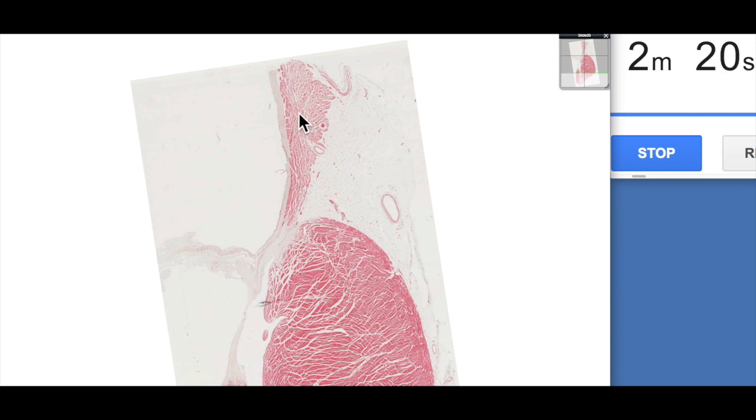Then we have the myocardium which of course is predominantly made up of cardiomyocytes and then we have the endocardium which is the internal lining which consists of a simple squamous lining and then connective tissue.